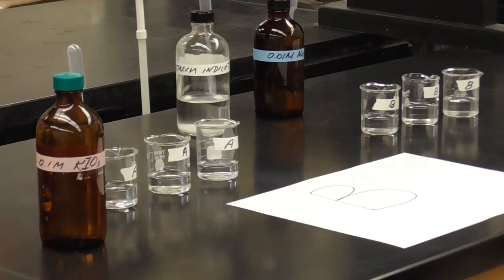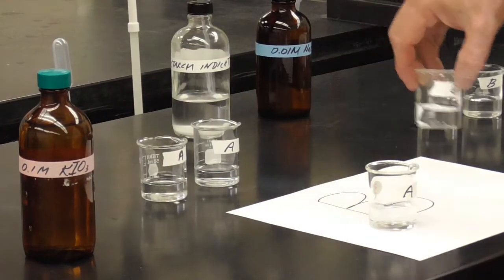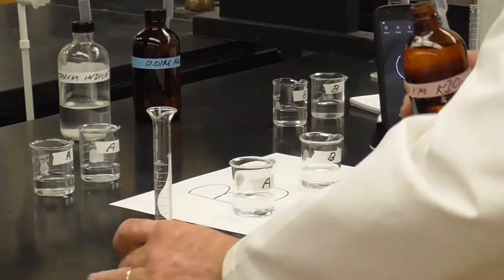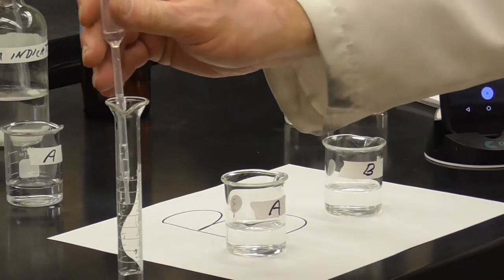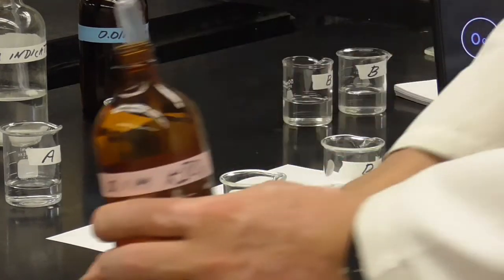All right, so we'll start with the first beaker of each. We need to put 2 milliliters of the iodate into A. There we go. Got 2 milliliters.